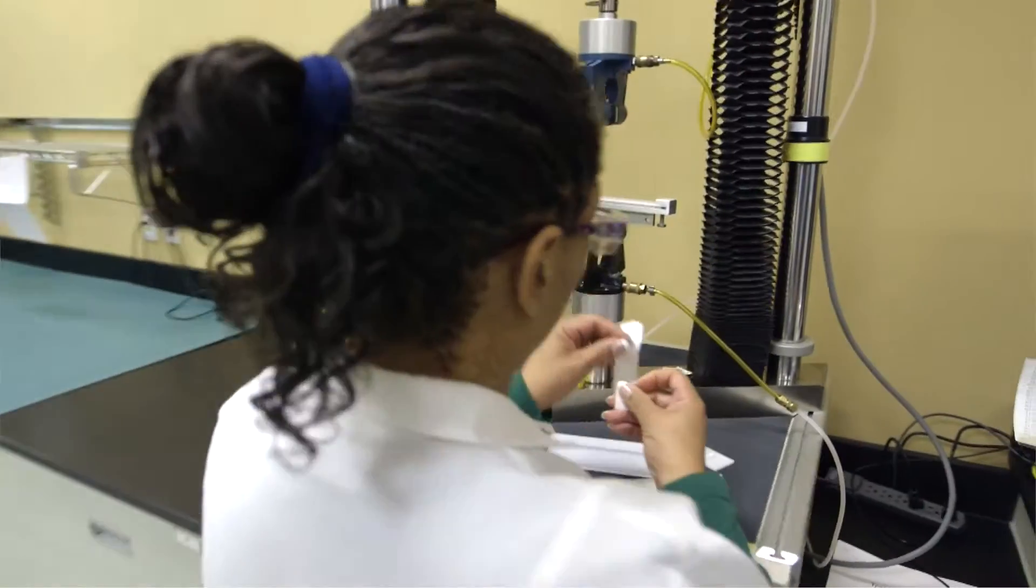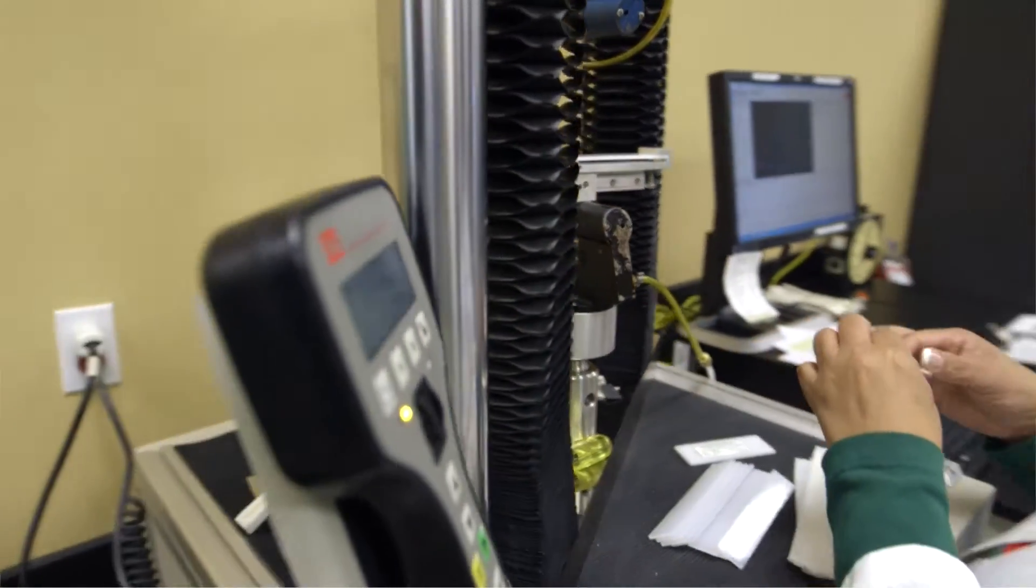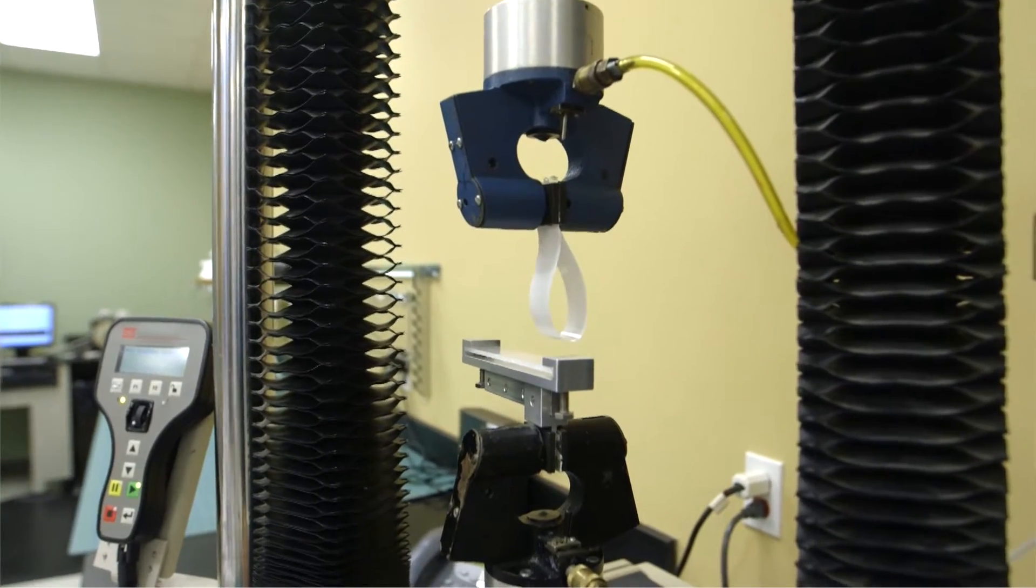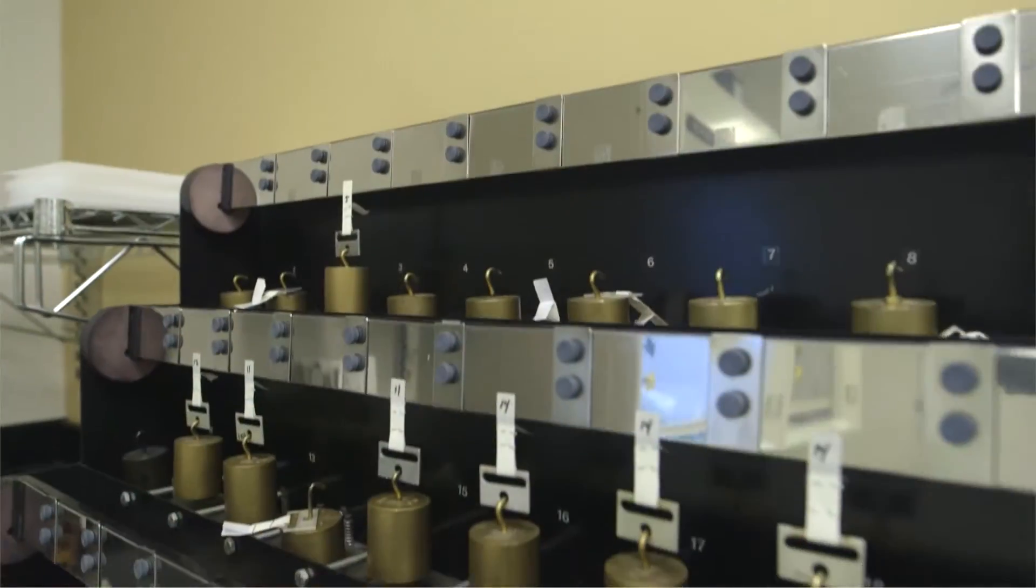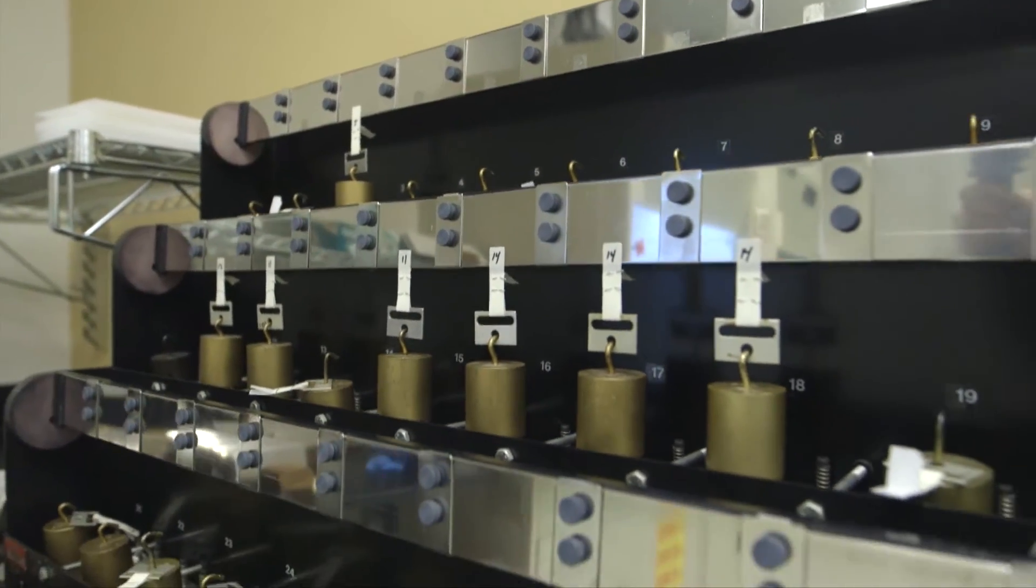The adhesion lab is really where it started, more than 80 years ago with founder Stan Avery. His keen understanding of innovation continues with us today. Our adhesion lab is where we study loop tack, peel adhesion, and shear on a variety of substrates and across multiple applications.